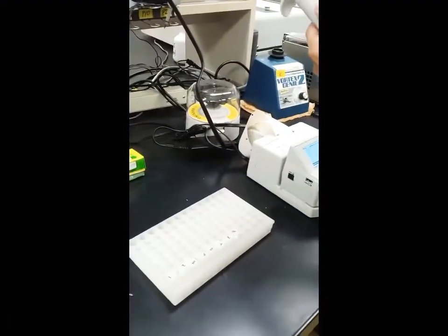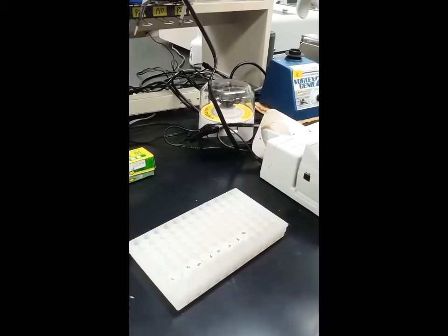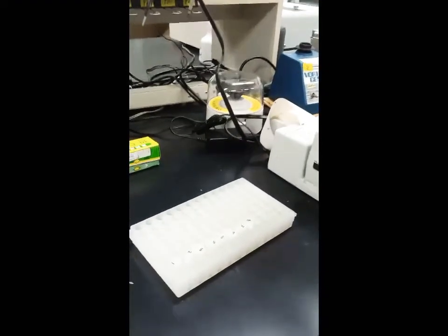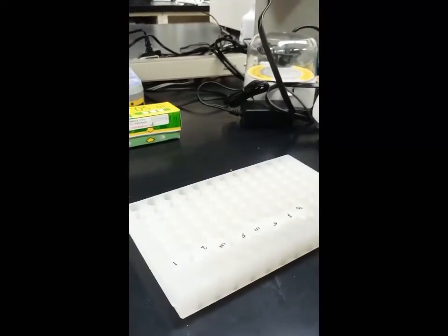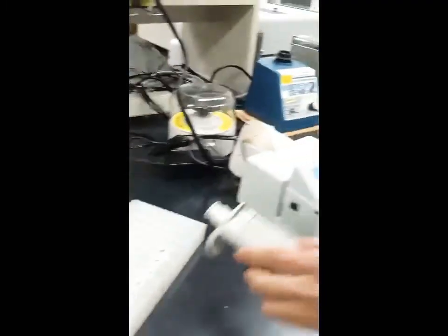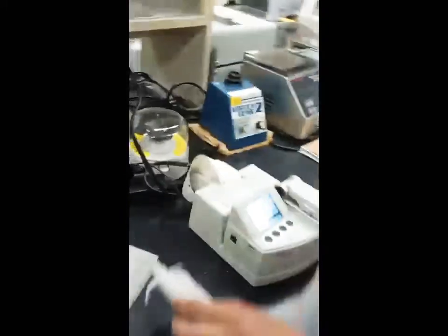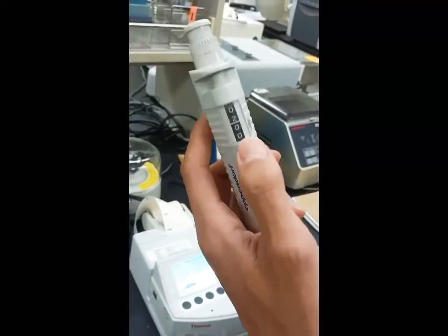Now we are going to check the quality of our final PCR samples. This is our previous sample, dissolved in TA buffer. We prepare it — this time we try with 2 microliters.